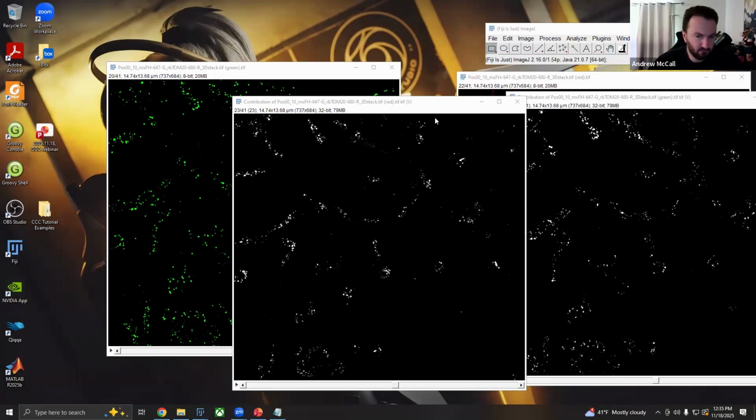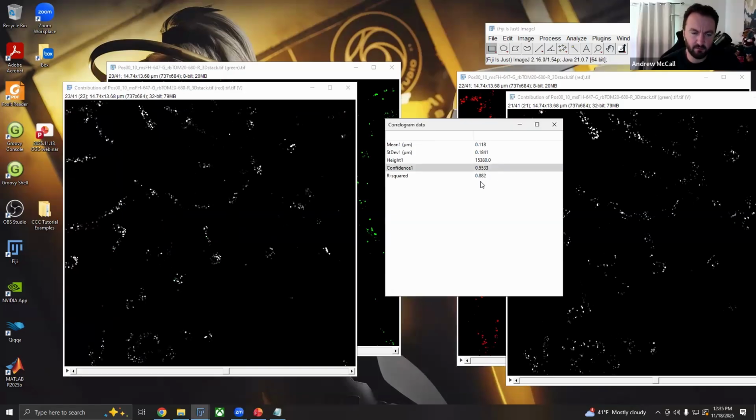When you randomize things, it's going to be different. So I don't think it's actually terribly beneficial, and I think the confidence value is kind of the better metric here, where we're basically just directly measuring that low spatial frequency component in order to identify, do we have the resolution necessary to answer that question.